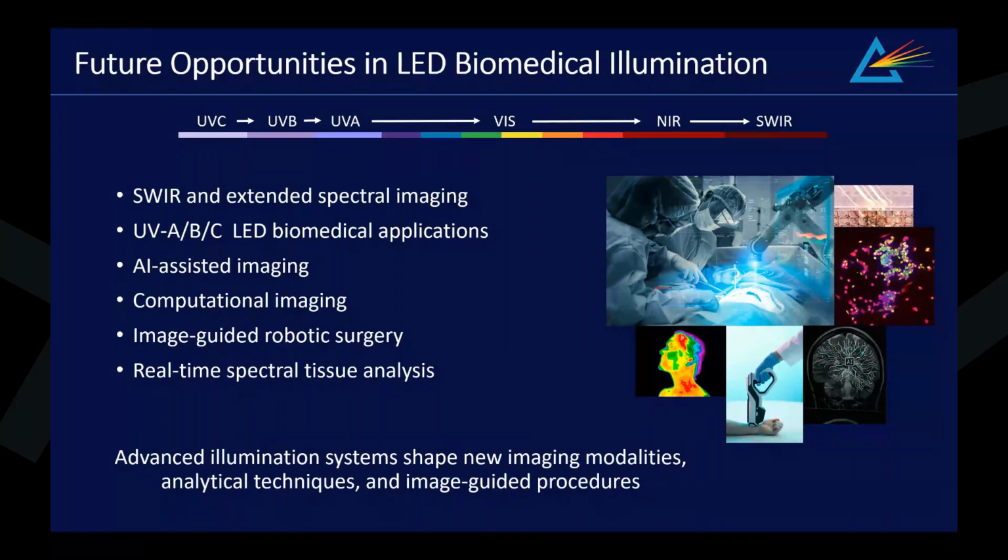More broadly, advanced illumination systems are helping biomedical imaging evolve beyond conventional visualization toward increasingly quantitative, spectrally selective, and information-rich imaging platforms.